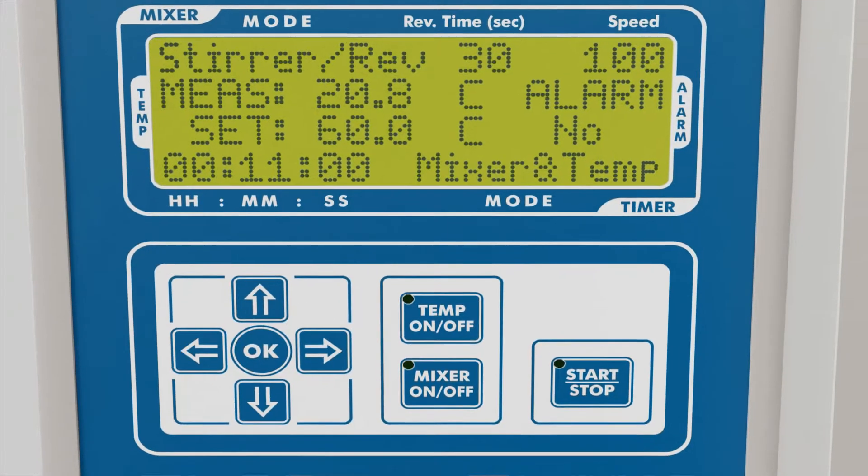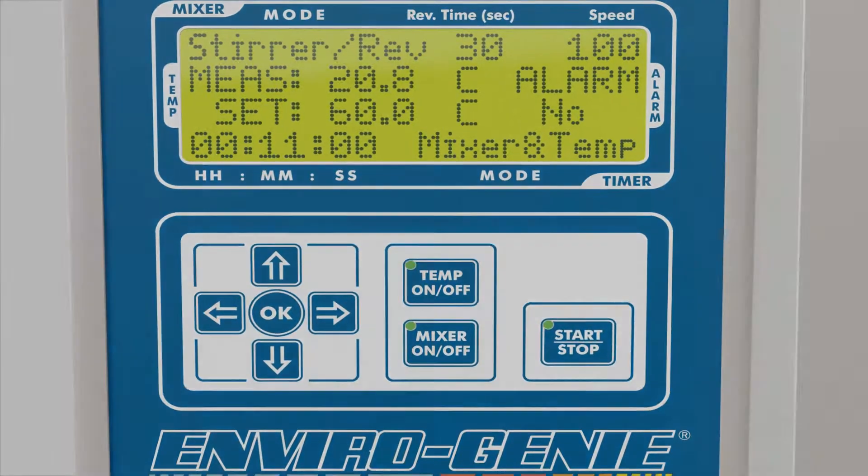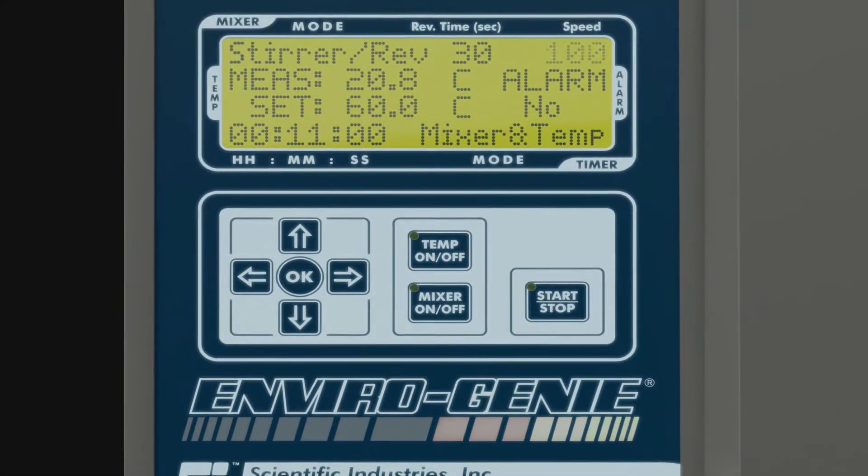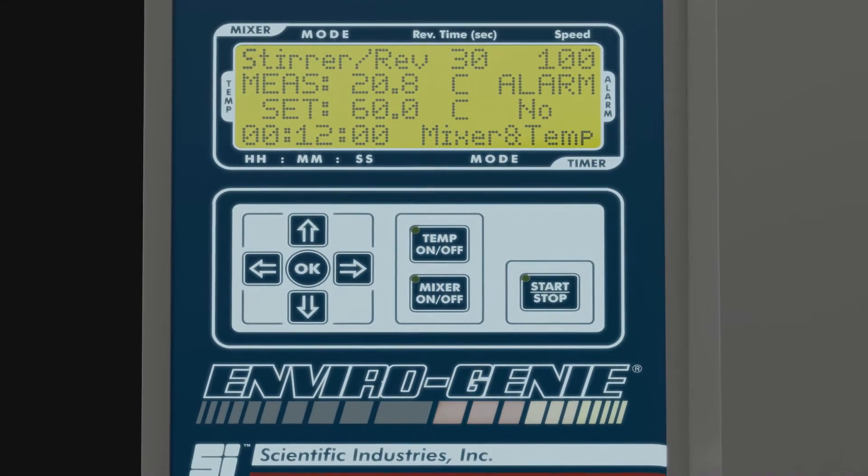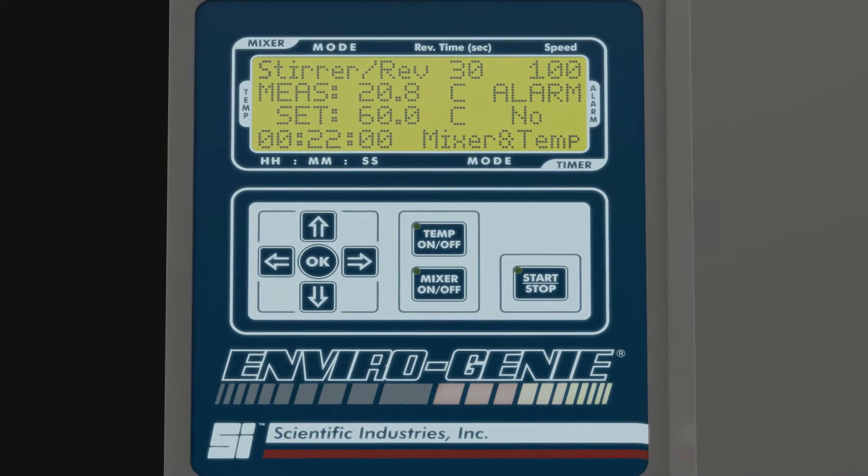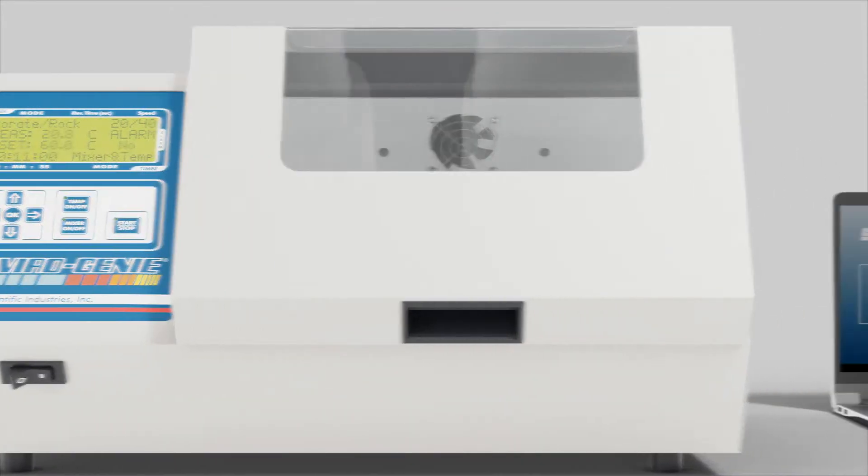Configuring your Enviro is effortless. Program your set points, speed and run time through our intuitive and easy to use interface.